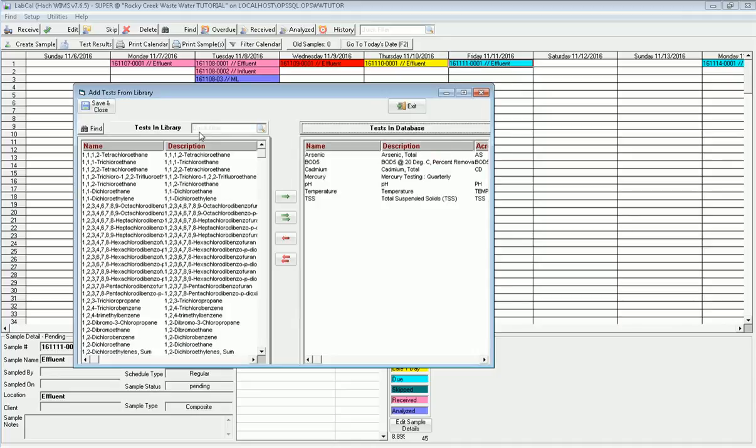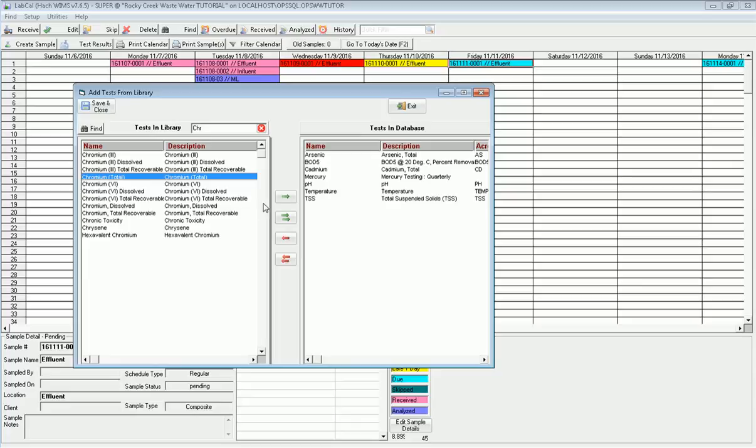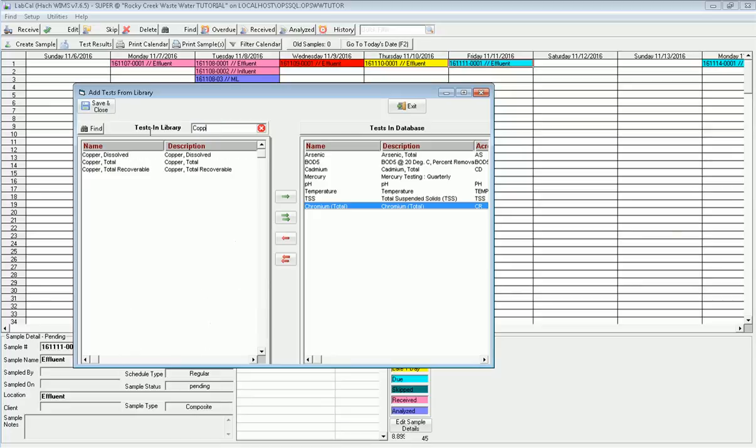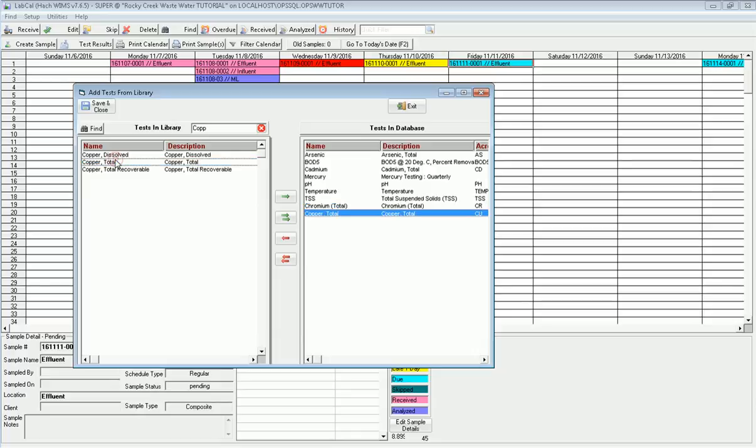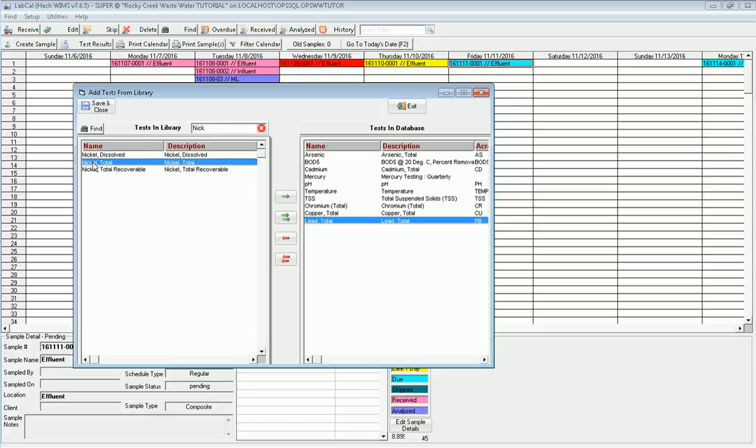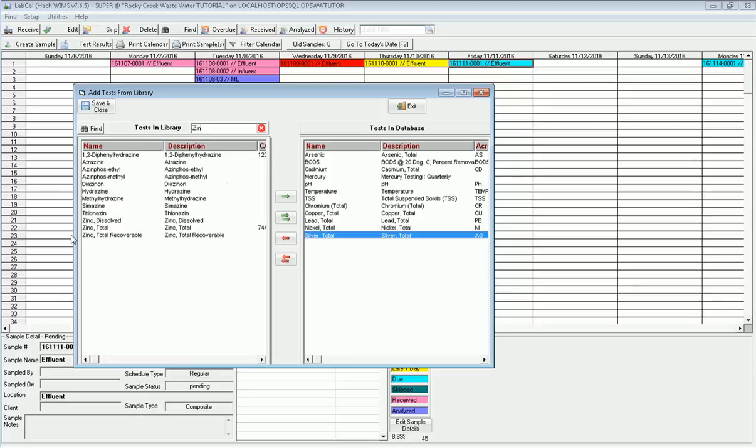I'm going to click add and I want to do chromium. I put that in my quick filter and the test I'm doing here is total chromium. So I bring that one over, then I go to copper. I'm doing total copper. I double click to bring it over. I need to get lead, total lead, double click on it. Nickel, and silver, and zinc, and then I'll be done.